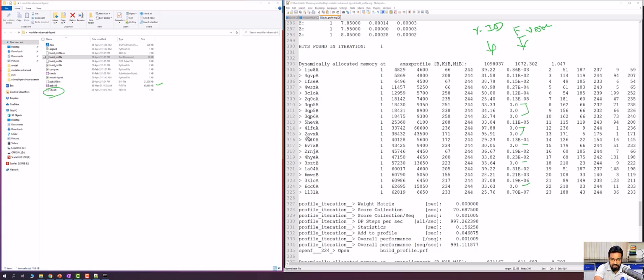So as I have good knowledge about this protein, I am going to choose this 2AVX of A chain as the template for modeling. The reason I choose this is because it's having 95.91% sequence identity. Even we have a sequence with 97.88, 4LFUA, but I'm not going to choose this because it's not having any co-crystallized ligand molecule, but this 2AVX of A chain has a co-crystallized ligand molecule. So it will be very easy for me to model the target along with the co-crystallized ligand molecule, so that I can easily define where the binding site is present for the docking and other procedures, right?